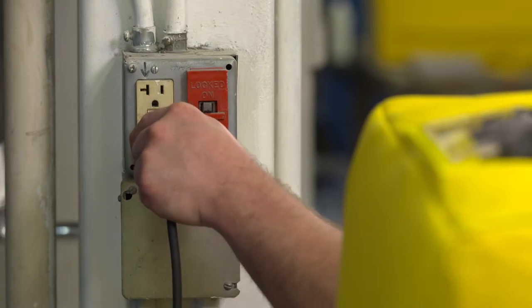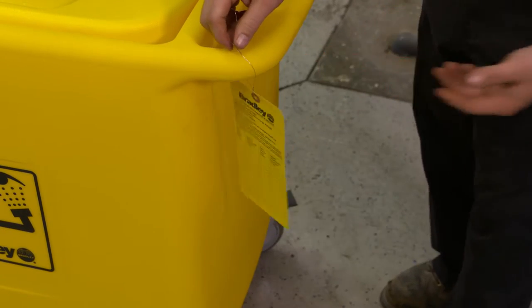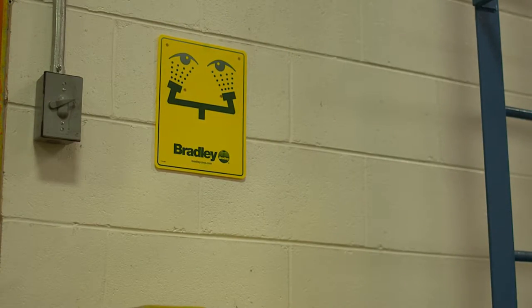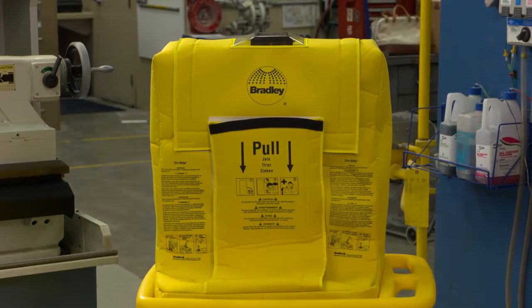You are now ready to plug the unit in. To document weekly inspections per the ANSI standard, attach the inspection tag and hang the safety sign in a visible spot near the unit using the hook and loop fasteners provided. The eyewash is now ready for use.